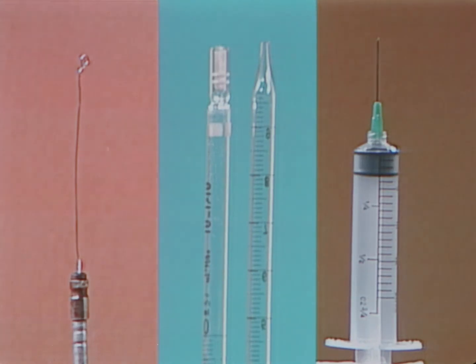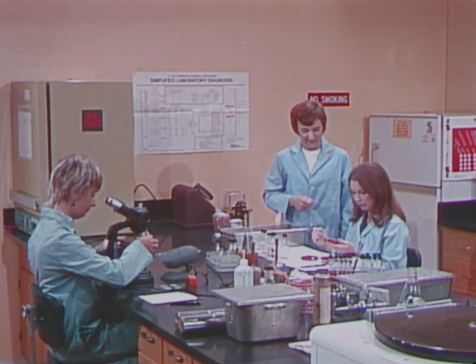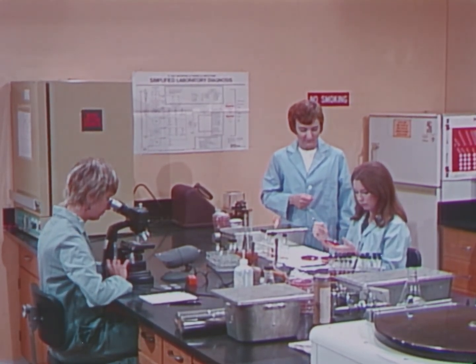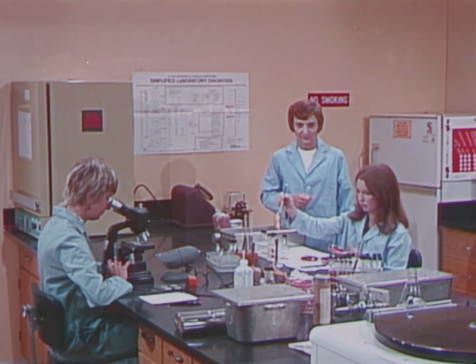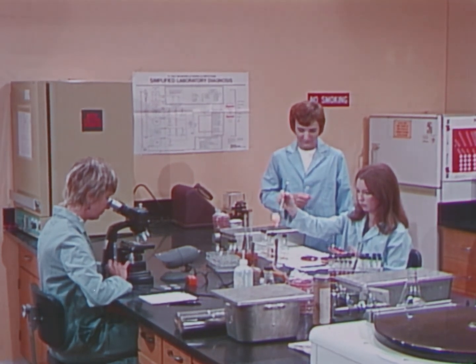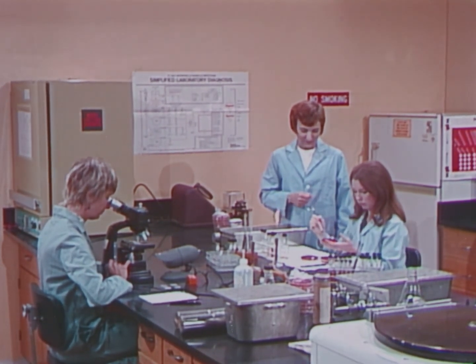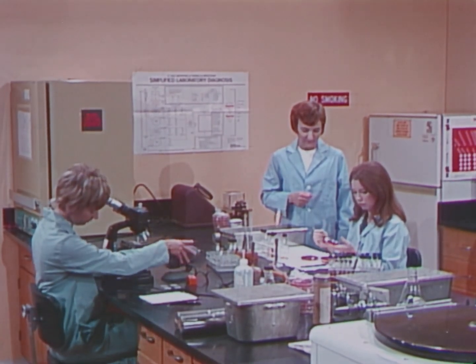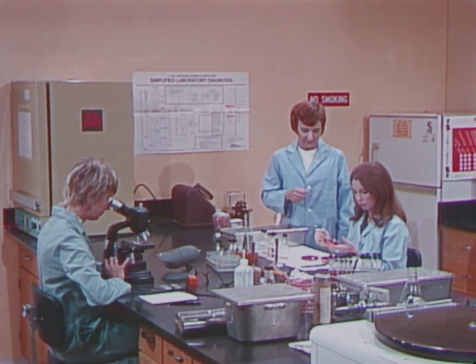Proper use of the inoculating loop, pipette, needle, and syringe will significantly reduce this contamination. Many infectious incidents stem from the use of techniques which create aerosols. By reducing aerosols as depicted in this presentation, you can eliminate many of the infections that commonly occur in the laboratory.